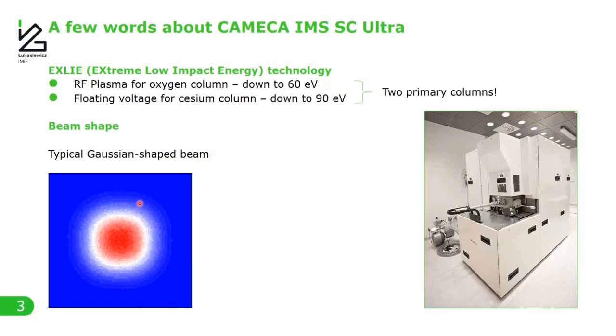Of course, in the aforementioned example of a silicon carbide diode, it doesn't really matter. We were making a very deep depth profile. This was almost 20 microns deep, so these 1 or 2 nanometers of difference, it's not a problem at all. However, when you start thinking about 2D materials like graphene, whose thickness is a single atomic layer of carbon, then the difference of 1 or 2 nanometers is huge when you compare it to the actual thickness of this material. So this is no longer acceptable.